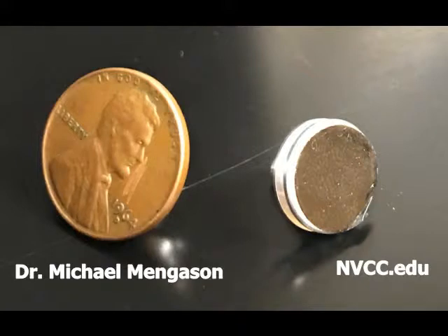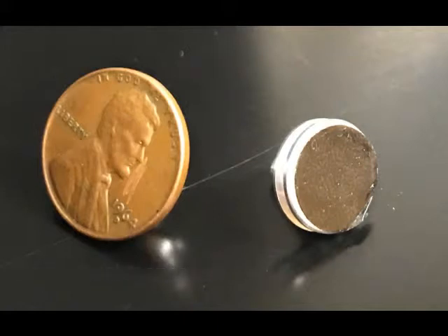This is going to be a short video where we show the steps that you would go through using a scanning electron microscope, which we call an SEM. We're using as an example here a simple copper penny. We're going to do an example of what you might want to look at so you have a better idea what you can use an SEM for.